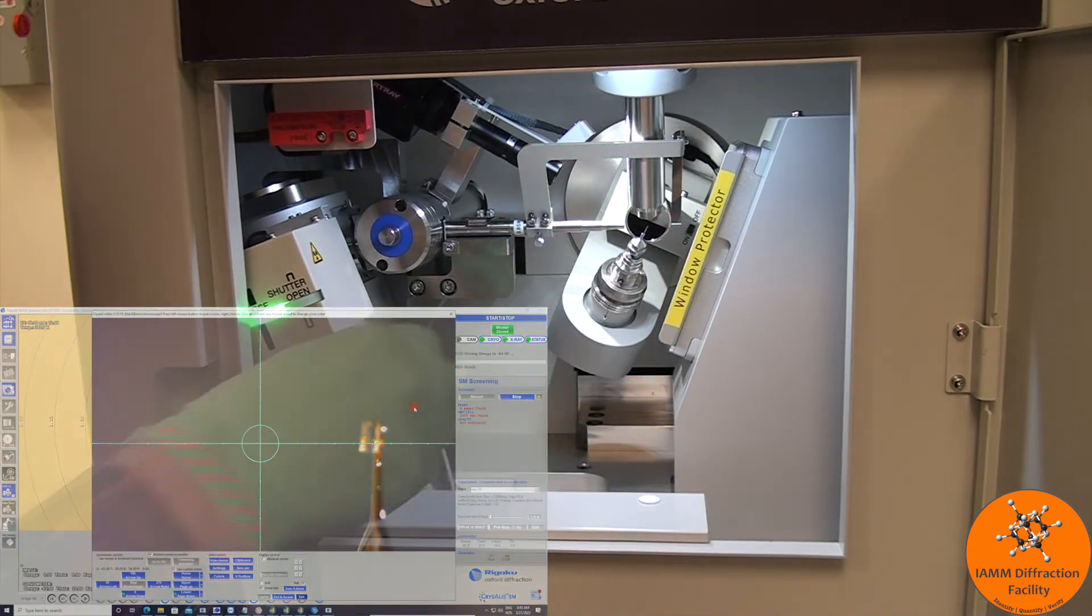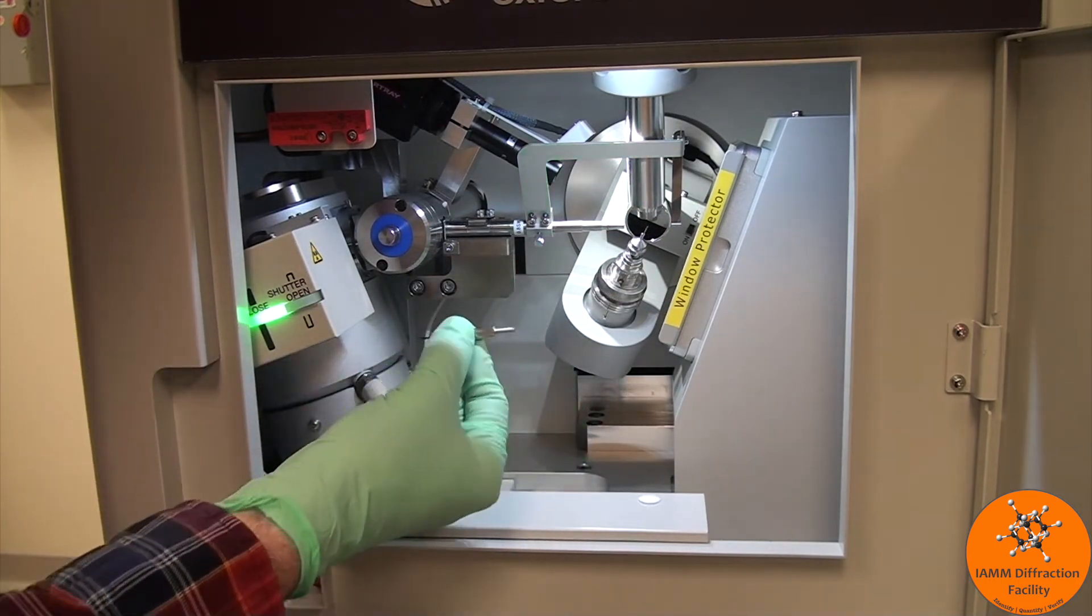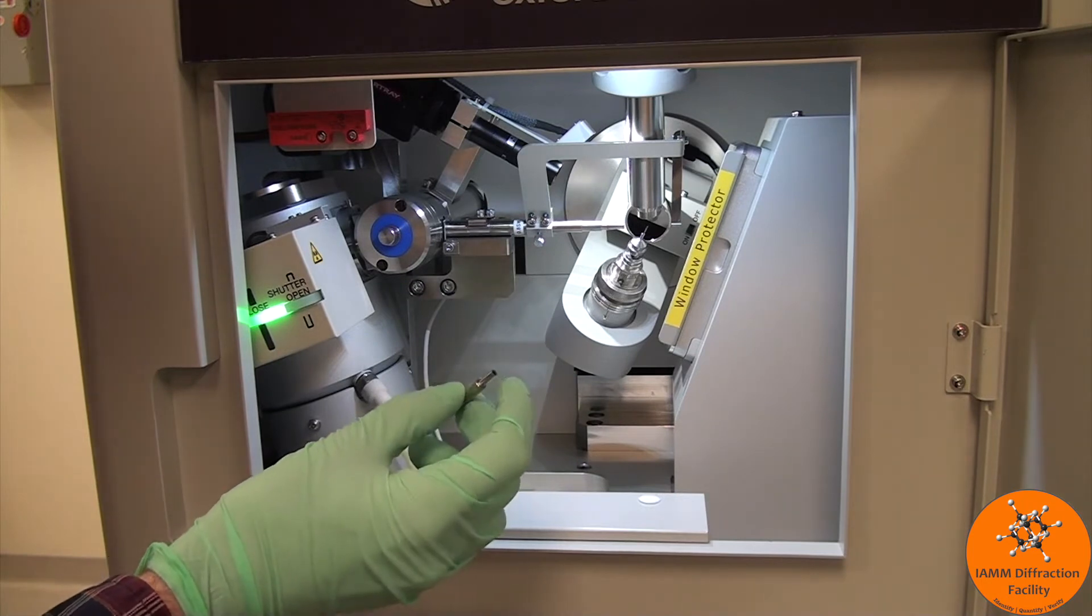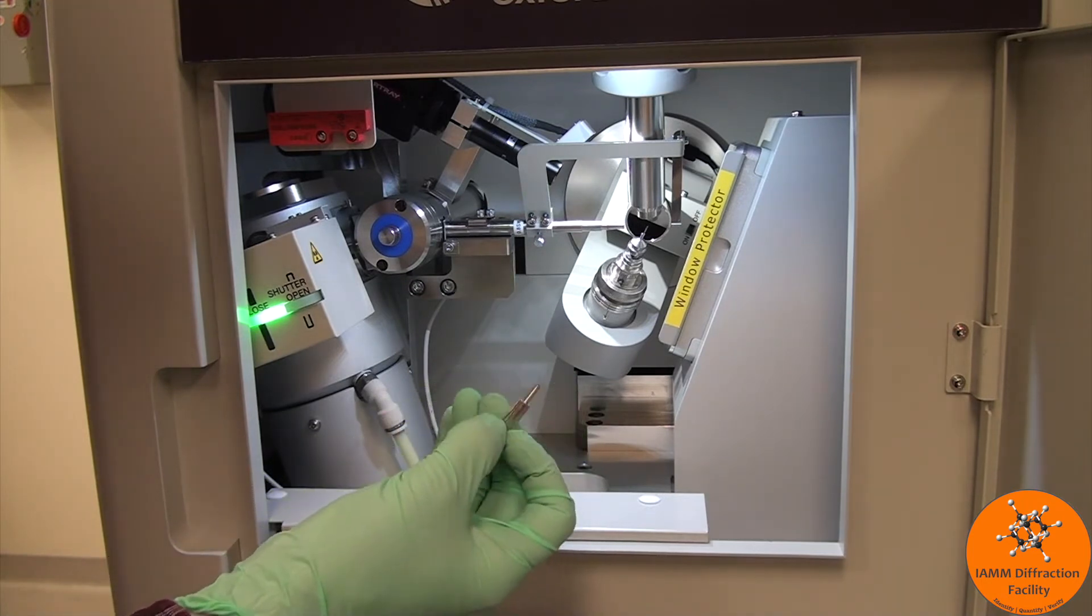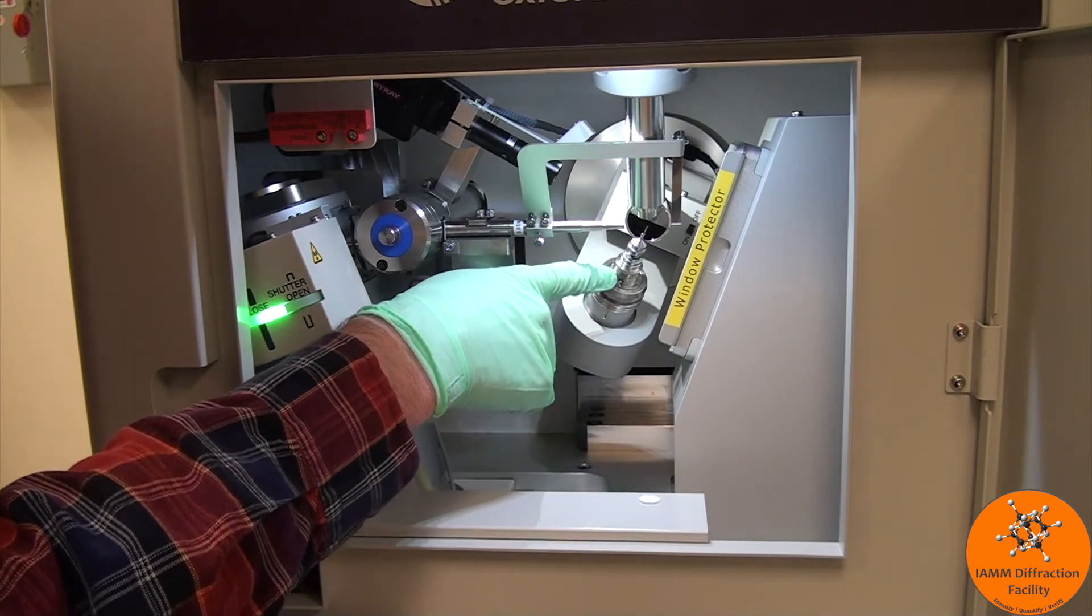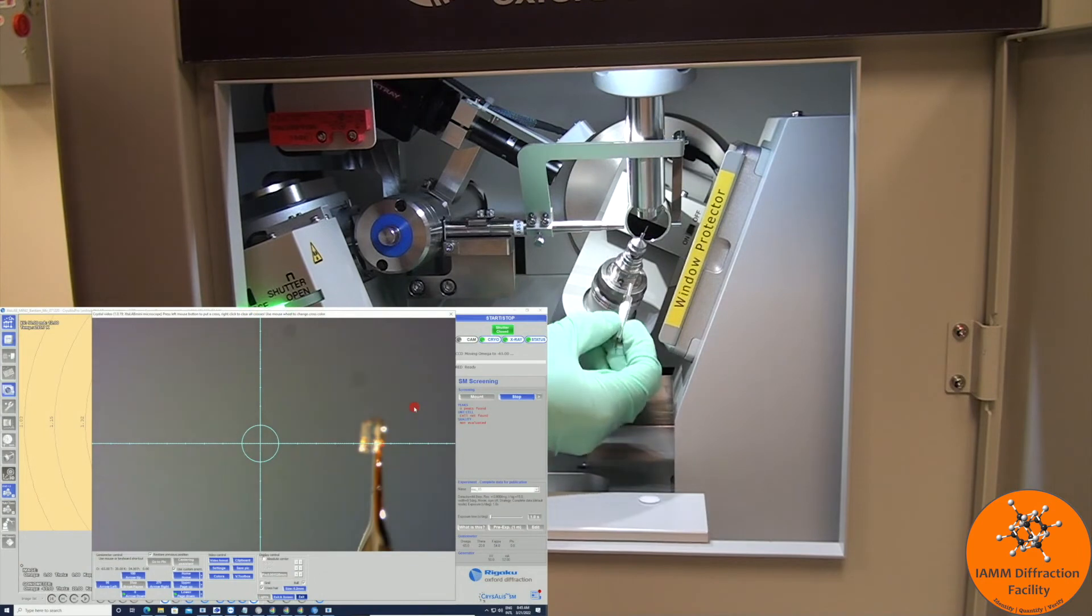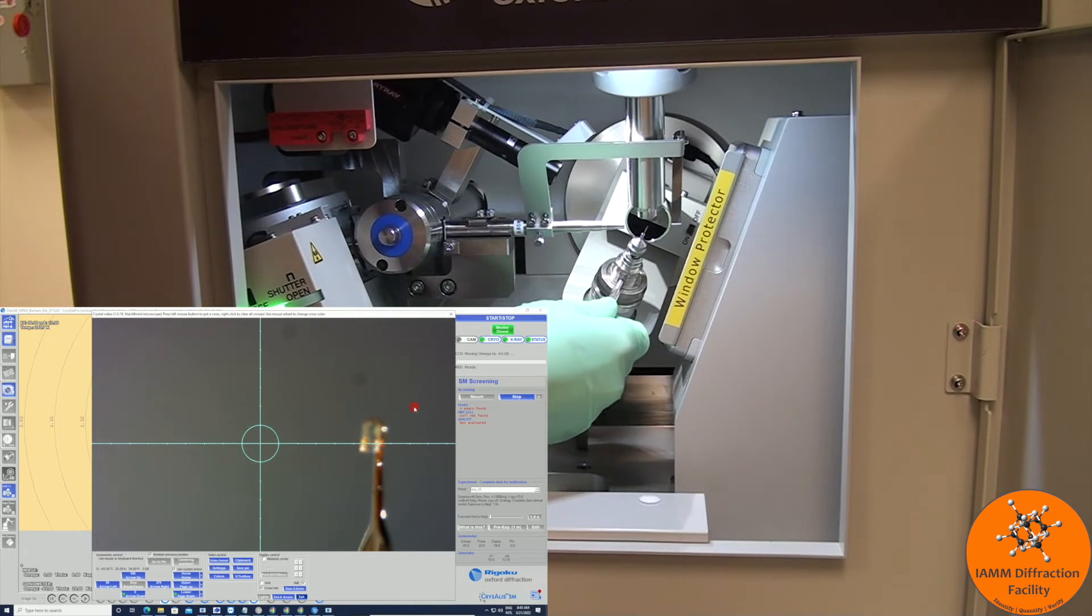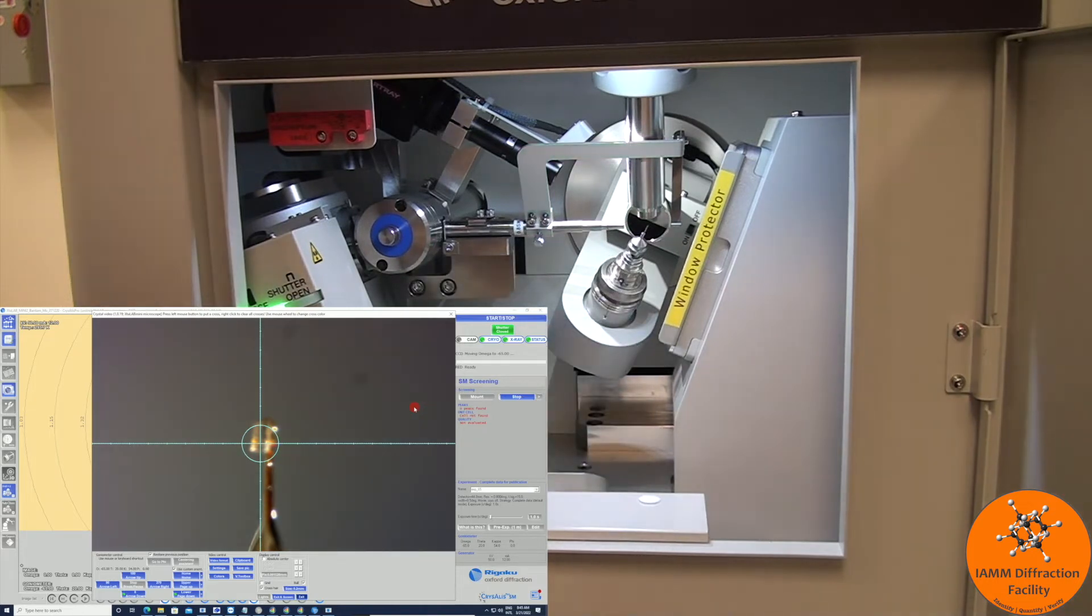I next need to move it to the left. We have this little tool inside, which has a larger end and a smaller end. We are going to use the large end and use it to turn this little piece here. All you do is stick it right on there, which can be a little difficult sometimes, and then rotate it. That's pretty good.